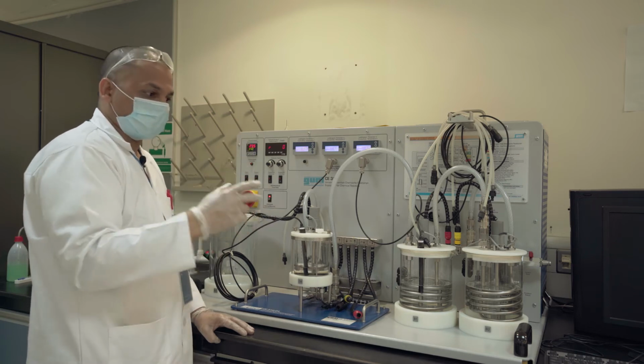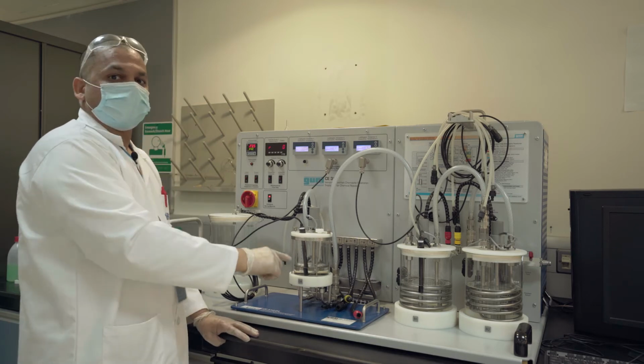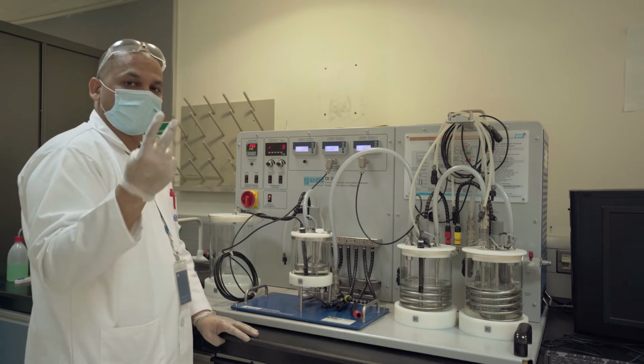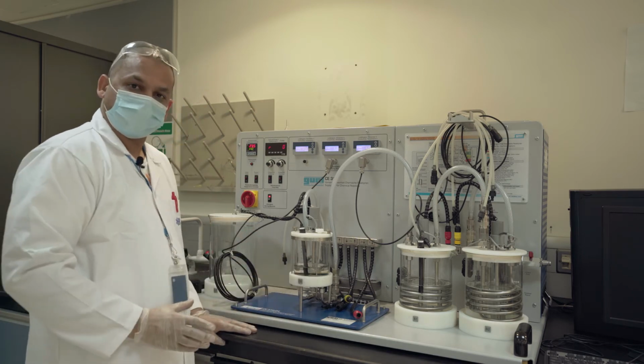So for the other one, the first experiment with the equimolar solutions gave 2, and this one gave 1, so I can just do the math to get the other one. So 1 and 1. That's basically how the batch reactor helps me.